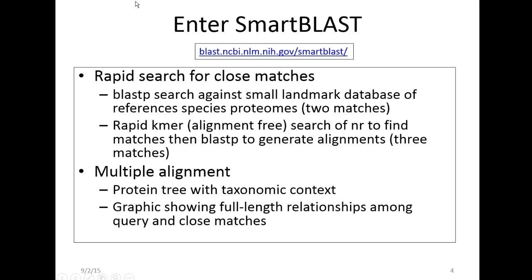SmartBLAST is particularly good at finding those close matches and giving you some context for them. That's the URL — it's linked directly to the BLAST homepage. It's also available when you run a BLASTP search as an option to try. It does a rapid search for close matches in two ways: a BLASTP search against a small landmark database of reference species proteomes, giving you two matches back, and another search against NR.